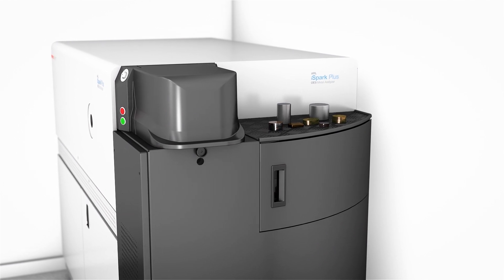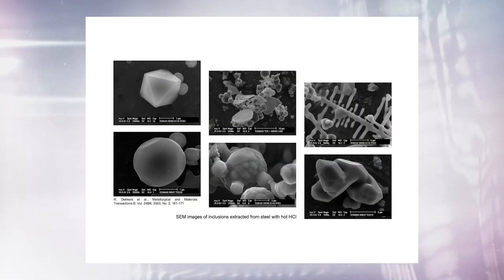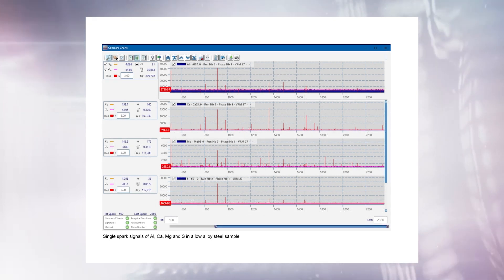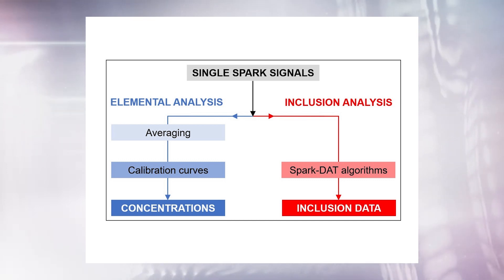Samples or accessories can be placed on the integrated worktop or in the storage compartment. Ultra-fast methods based on special signal processing with SparkDart algorithms make it possible to analyze non-metallic micro-inclusions during elemental analysis without wasting time.